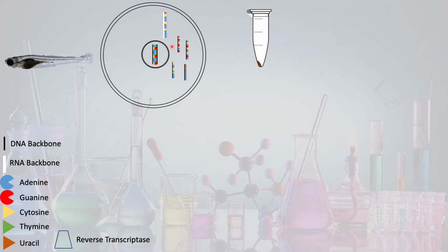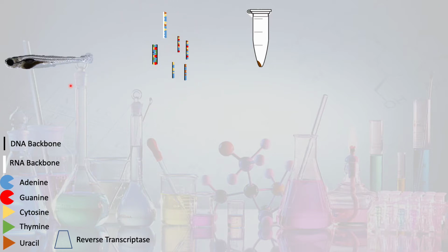Right, so now we're going to pretend we are in class and we're about to perform our RNA extraction from our zebrafish. So they've been treated. We have them in lab. We're going to anesthetize them and euthanize them. Once we homogenize their tissue, all the tissue transfers into one of our centrifuge tubes.